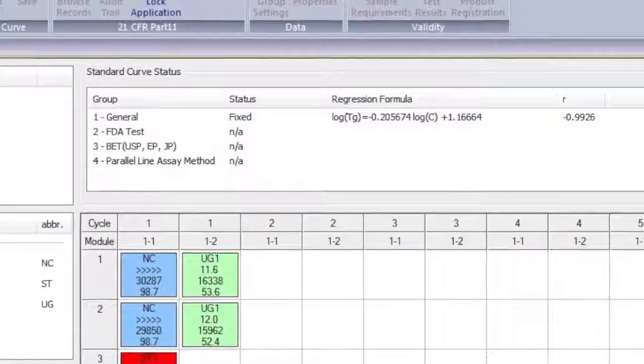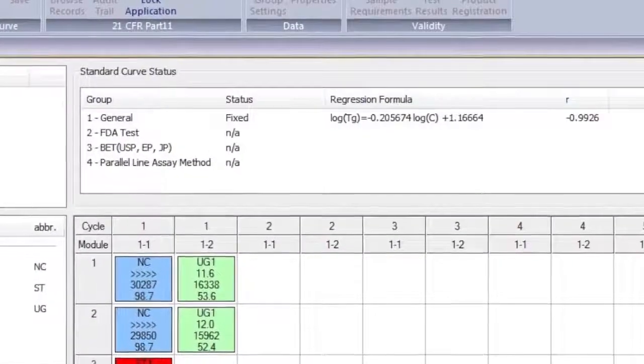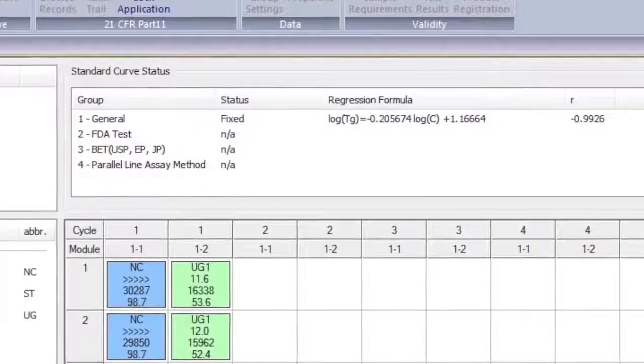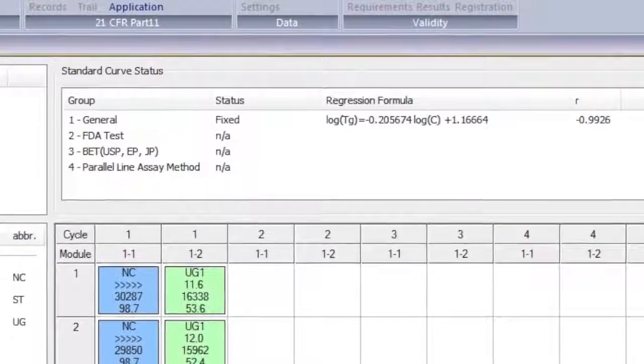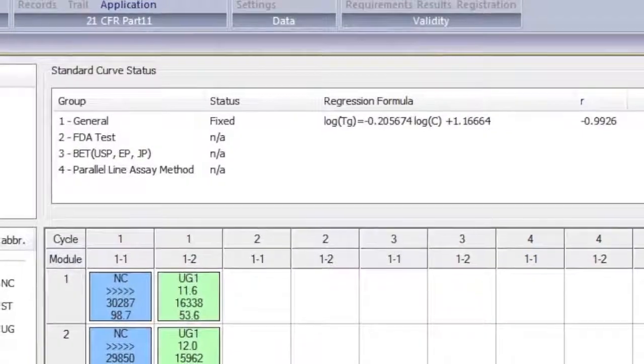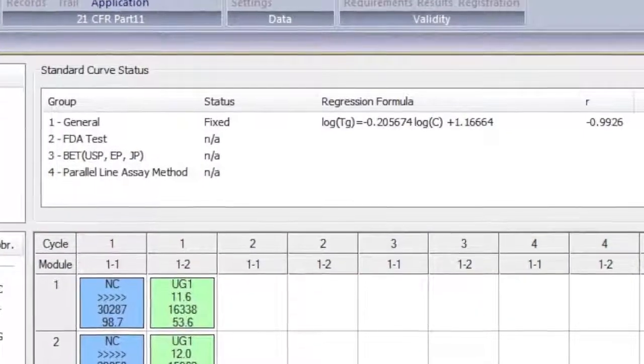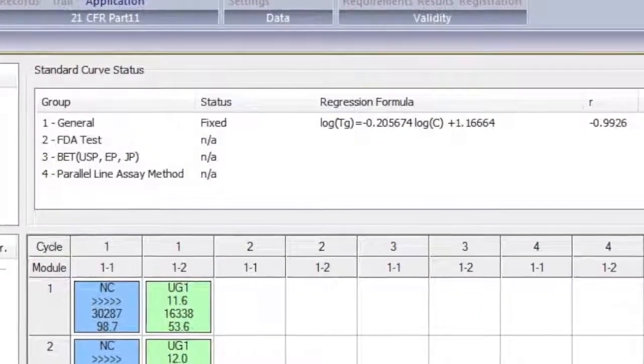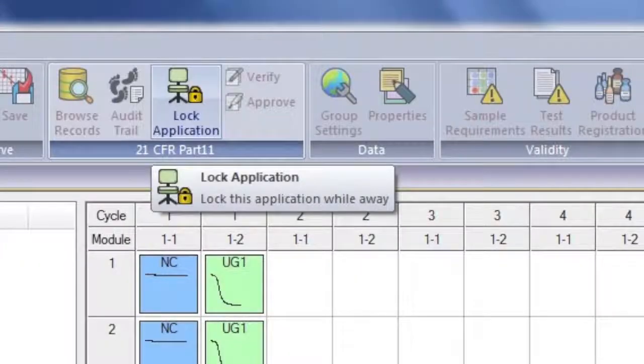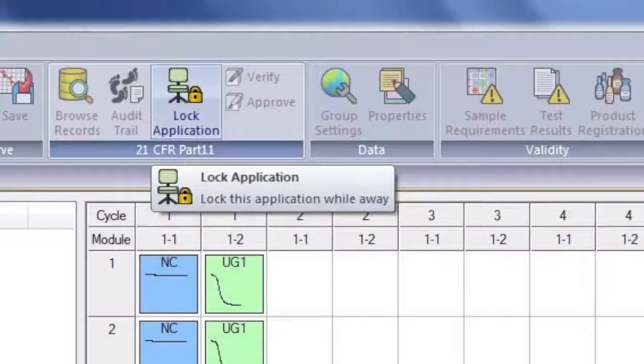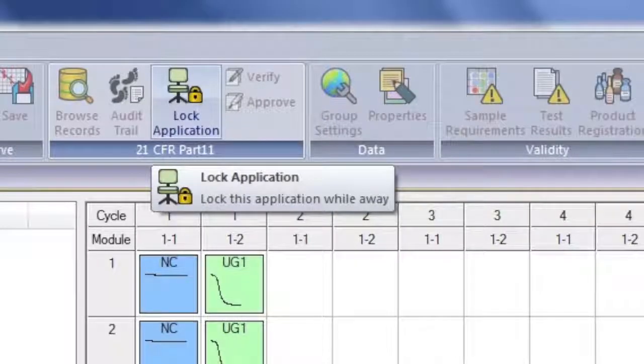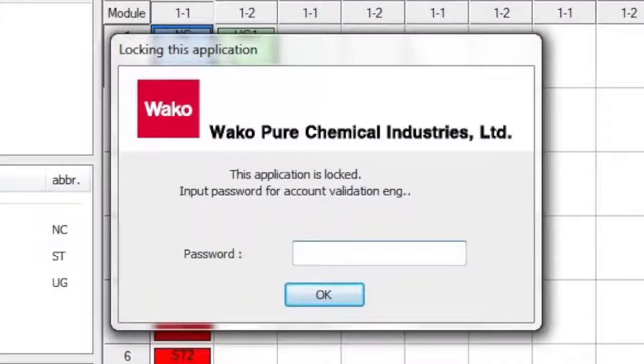The data now generated from our standard samples is able to create the standard curve. The LOCK application allows users to leave their computers safely as the testing cycle completes.